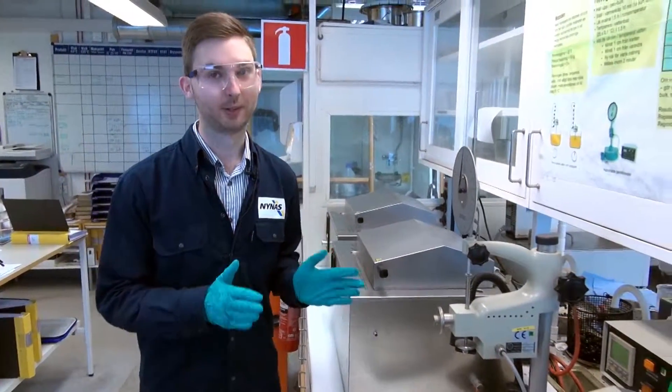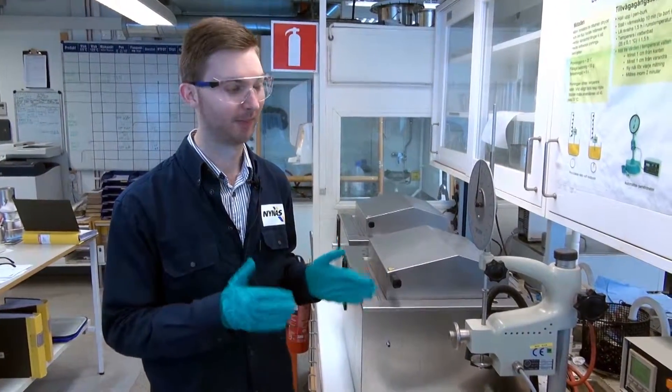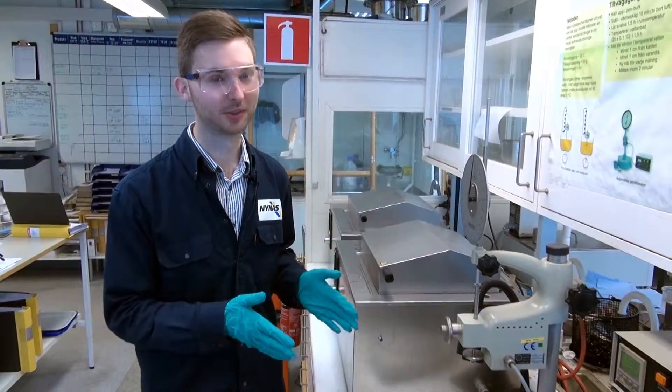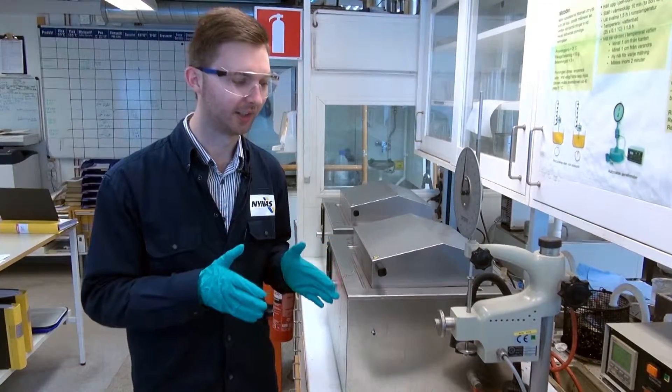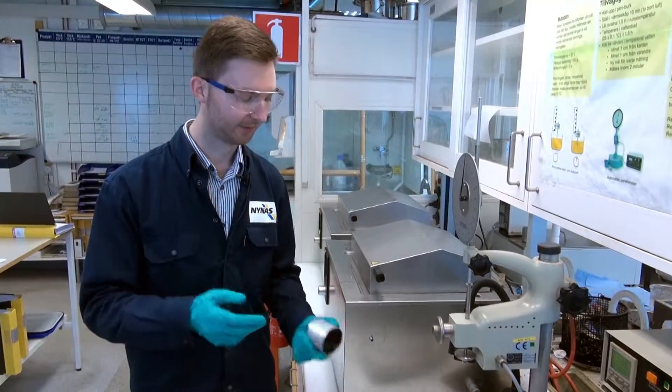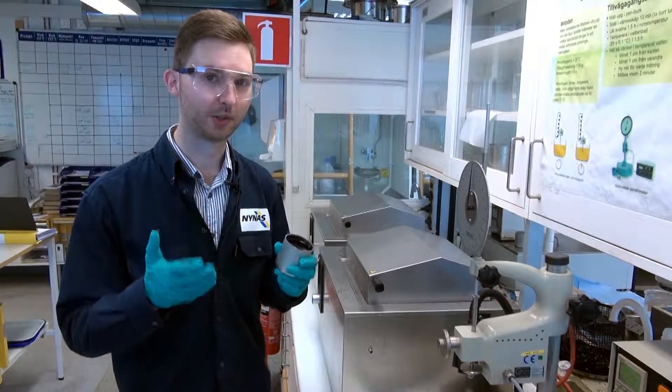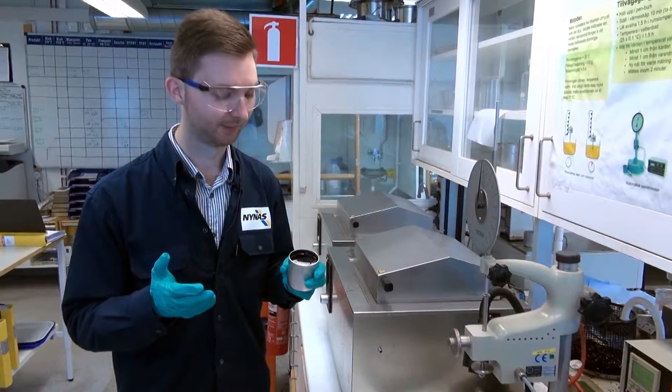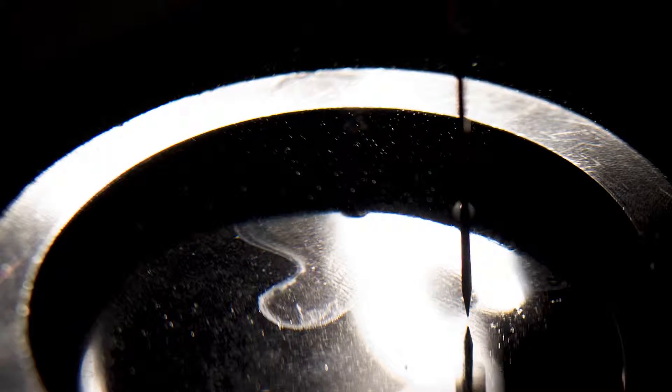So this here is the penetration equipment. It's probably the oldest bitumen measurement, but it's still used. It's some kind of viscosity measurement, but in reality it defines the consistency of a product, of a bitumen, so the hardness or the softness of the binder. We measure how deep a standard needle penetrates into the sample.